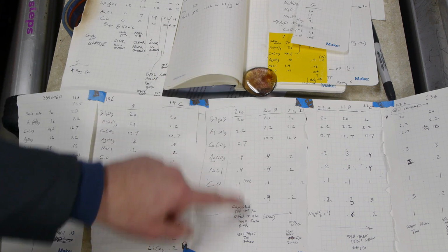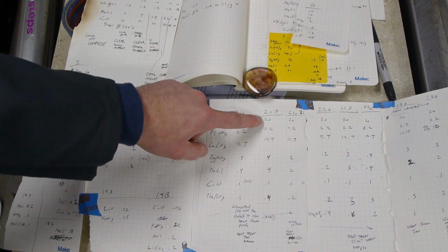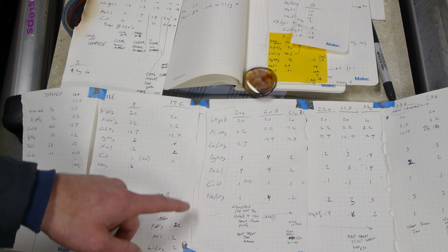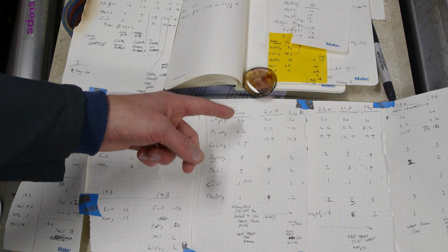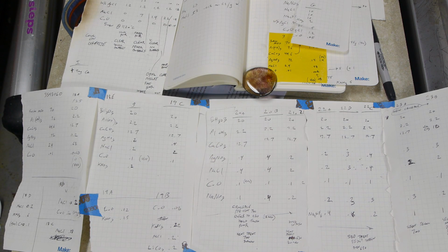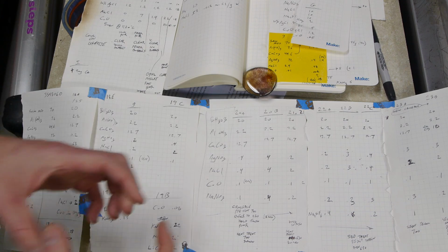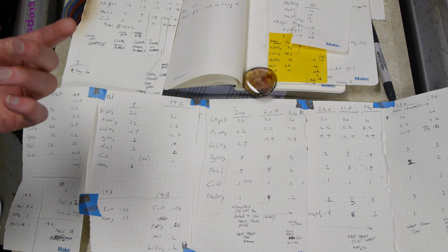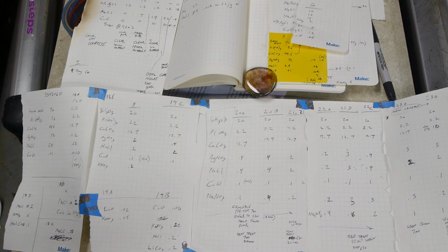So I'm making these tiny ones, we're starting with 20 grams of borate. This whole glass ends up being about 20 grams because all this carbonate gets burned off. So we start with maybe 30-something grams of ingredients, and we end up with 20 grams of glass. That's really not very much, and the fact that the melting vessel has a lot of surface area to it means that a lot of the silver is burning away. So you're basically talking about making a soda and then leaving it on the counter and waiting for it to go flat, but not too flat, and then stopping it at just the right point so that you have just the right amount of ingredients.